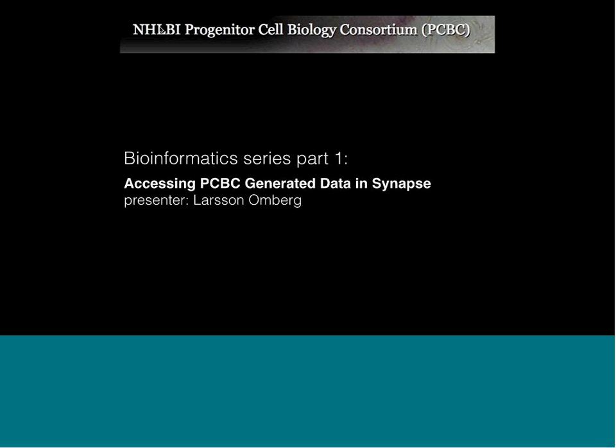And today, I'm going to be talking about the first in a series of tutorials, and we're going to be talking about how to access the PCBC data and how to explore the data that is currently stored in Synapse.